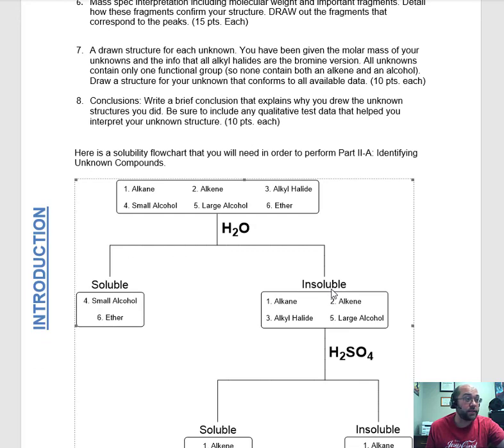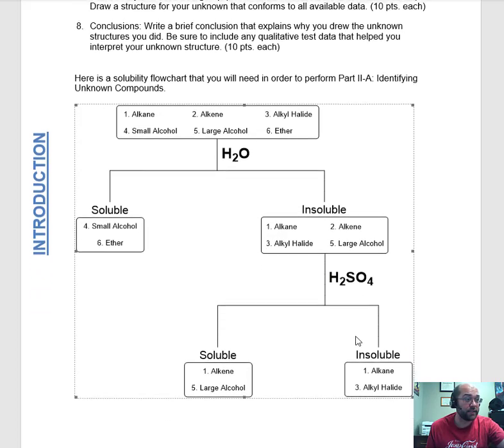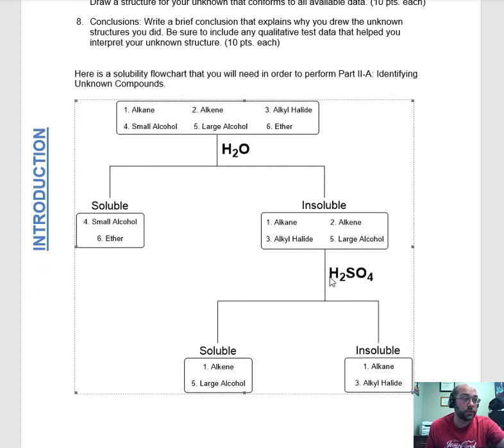And so then the next step would be, for my alkene, if that's what I got based off my spectra, what would I expect with sulfuric acid? Would I expect it to be soluble or insoluble in sulfuric acid? Well, it will undergo a reaction in sulfuric acid, so I would expect it to be soluble. All right? That's what we're looking for.